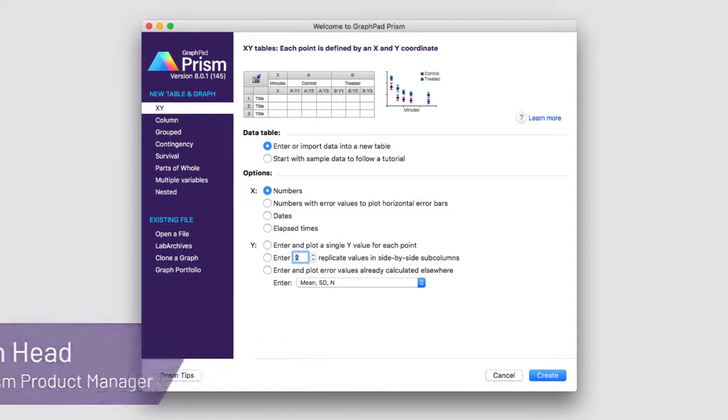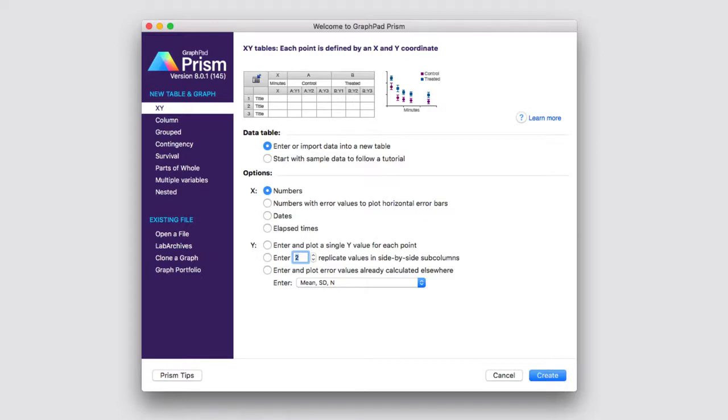In this video, I'm going to give you a brief tour of Prism and introduce you to a number of basic features and concepts within the software that'll help you get up and running with your own data to perform some basic analyses and generate some graphs.